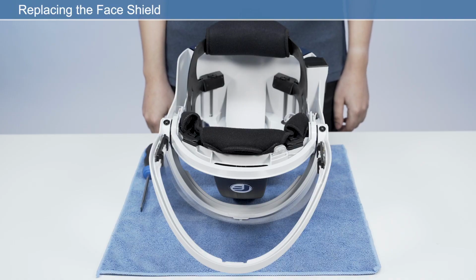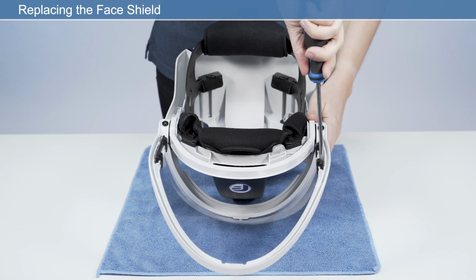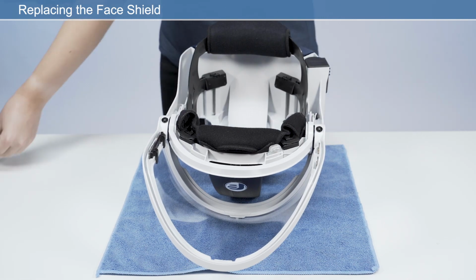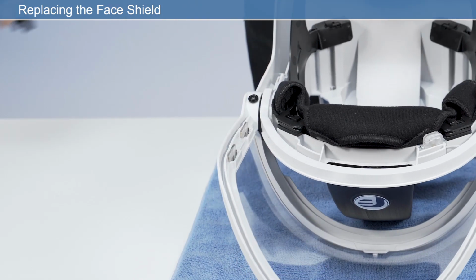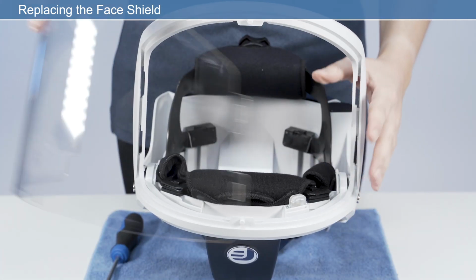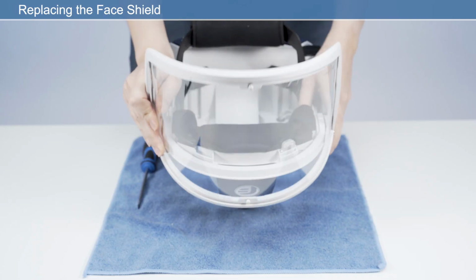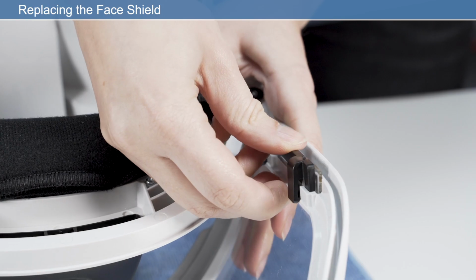To replace the face shield, turn the unit upside down to gain access to the face shield retainer clips. Insert a flat blade screwdriver into the slot to disengage the retaining clips on the back side of the visor frame, and release and remove from both sides. Remove the face shield from the frame. Carefully reassemble, fitting the new face shield into the visor frame, and replacing the retaining clips on each side.